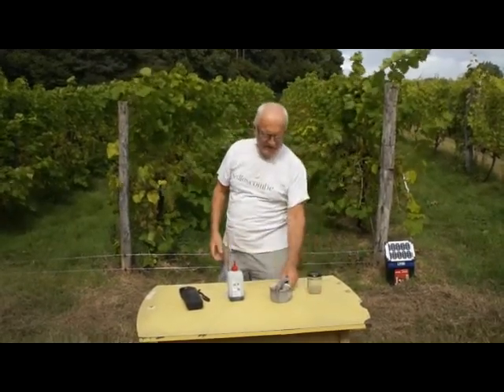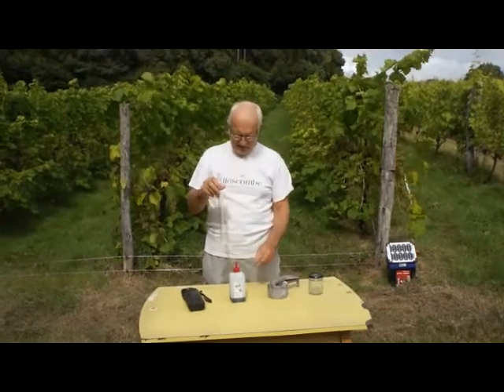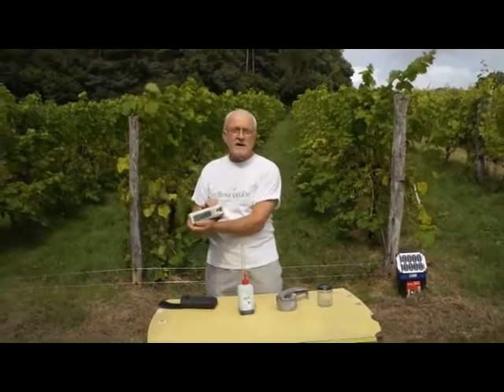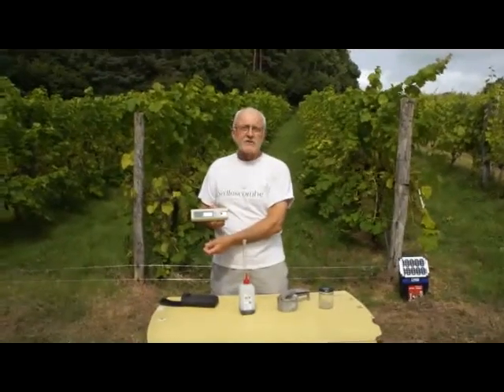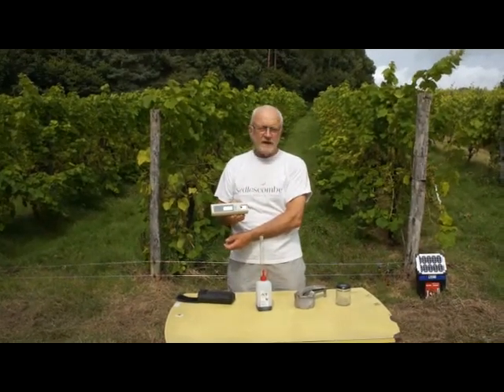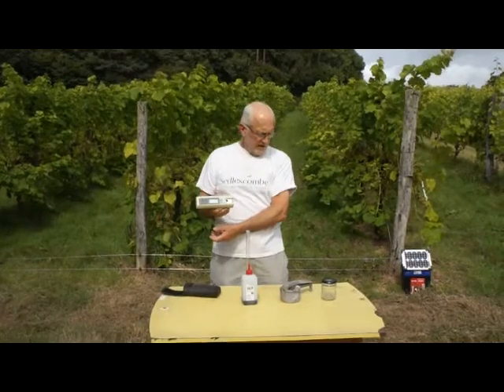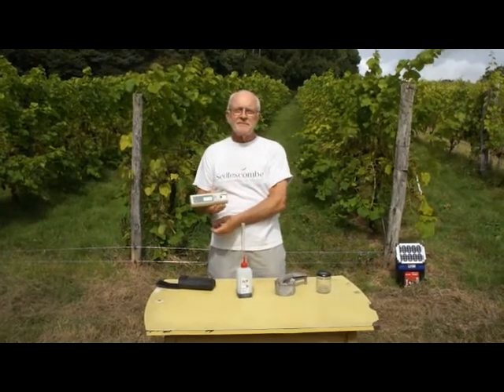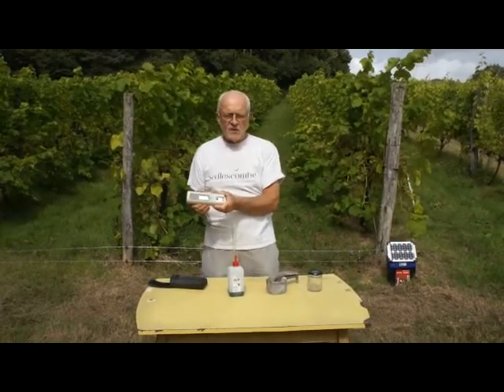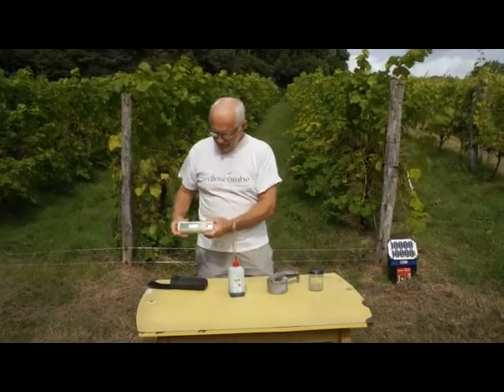Then we're going to squash them down in this little press, and with this we're going to test the acidity, and with this digital refractometer we are going to test the sugar level, and then we can compare with other years. We're now on the 9th of September, so we can compare with other years and know whether we're early this year, average, or late. Let's get going.